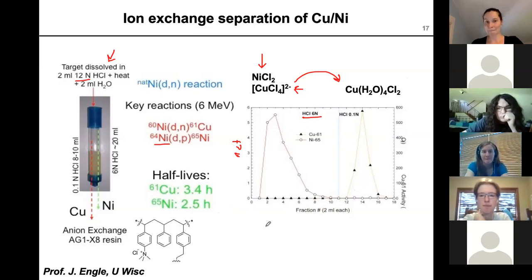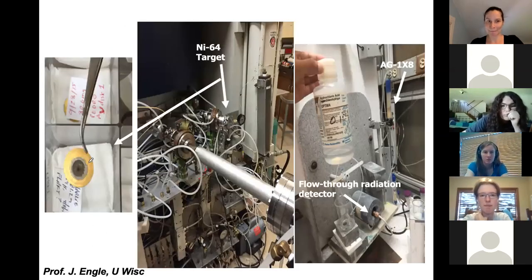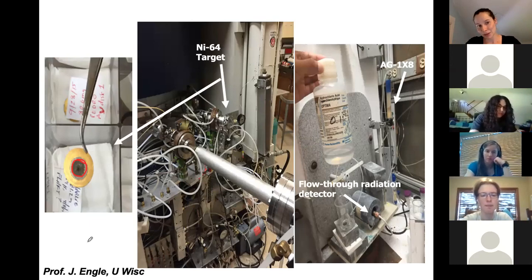On the last slide, there was a picture of the disc. Was the yellowish metal nickel and then the whole center copper? Or no, the center is the nickel. So this is the target that I circled for you. And then you actually have a plate around, and we're going to see that with the yttrium target for the zirconium targetry. You need to have basically something where you solder on this target itself that's not going to be reactive with the beam. So the yellowish stuff is just the unreactive thing that's soldered to the actual target? Correct. Got it.